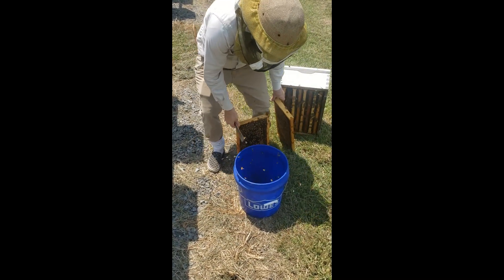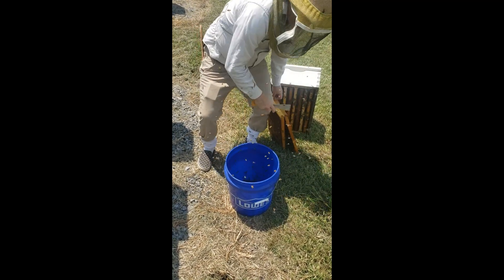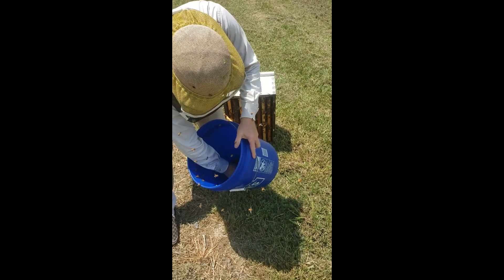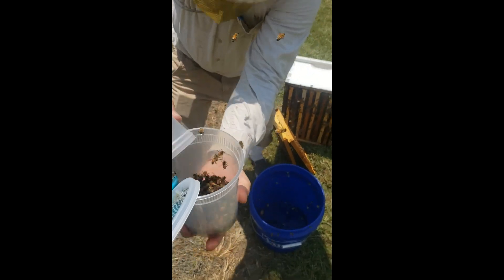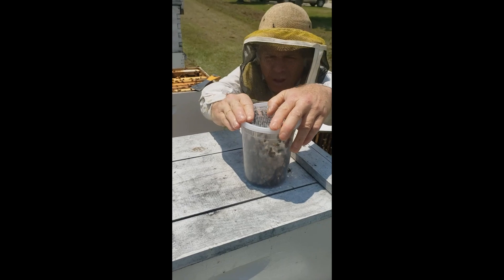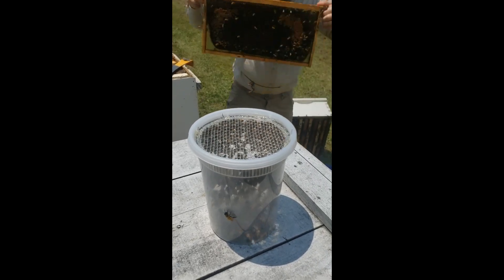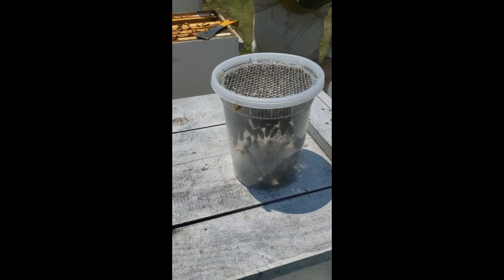It's a quick sharp shake like that. These are going to be young bees so they're not going to fly away too much. He's going to then take the scoop, and that's going to go into the container. Then with the container, put the screen lid on. It's easy to do this with two people. You should be able to go pretty quickly from the bucket to the sample cup to the cup with screen lids.